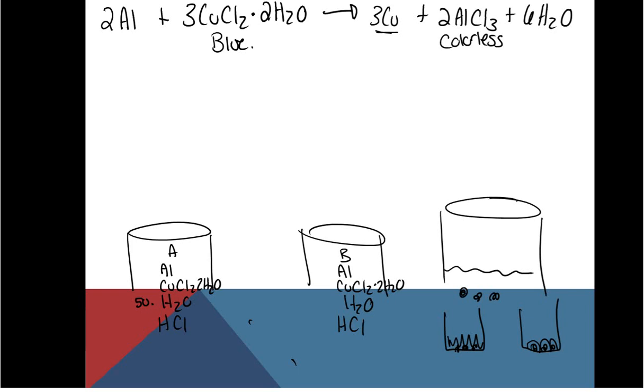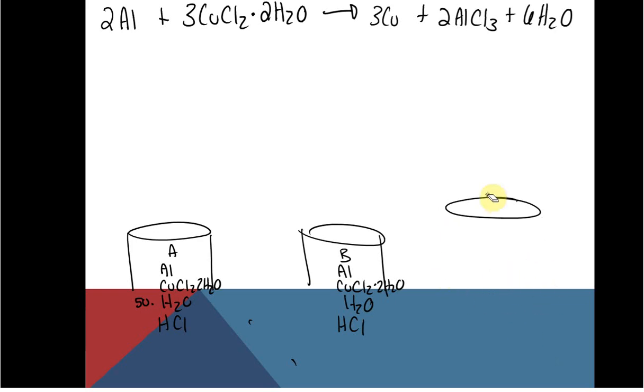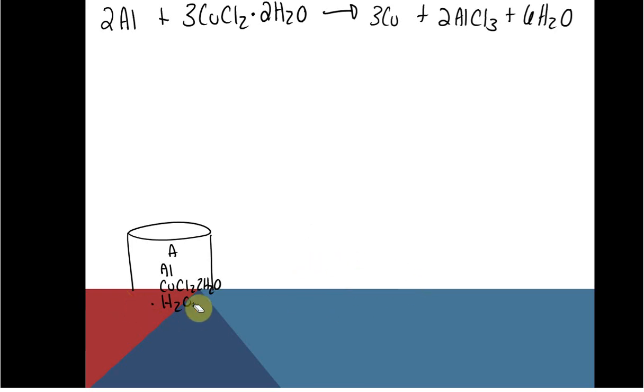If you ever spilled rubbing alcohol or acetone, generally you can watch those liquids evaporate very, very fast. It's the same concept here, it's just methanol is even quicker. So you're going to decant that methanol and you're going to heat and you're going to be left with this copper solid. Now, technically, you made some water, you made some aqueous aluminum chloride, but the reason we're going to be talking about copper is it's the solid that's left in that beaker. And so for us in the lab that we have, that is the easiest one for you guys to measure. And so when we're talking about our product, all of our measurements are going to be done with copper solid just because of that.